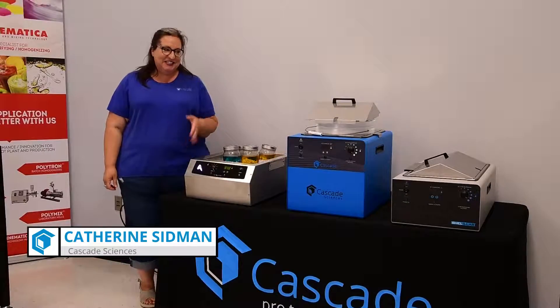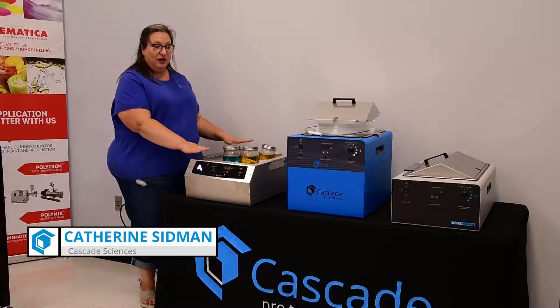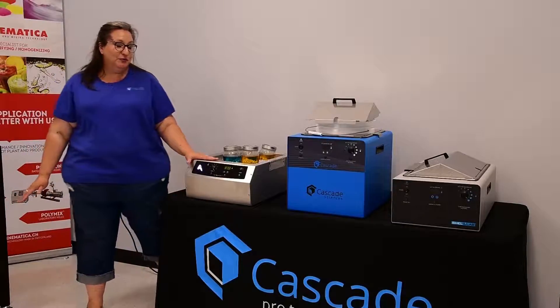I'm Katherine from Cascade Sciences and today I'd like to talk to you a little bit about our bath line, our water bath line. We have standard water baths, our deep water bath, and our lab armor bead baths.